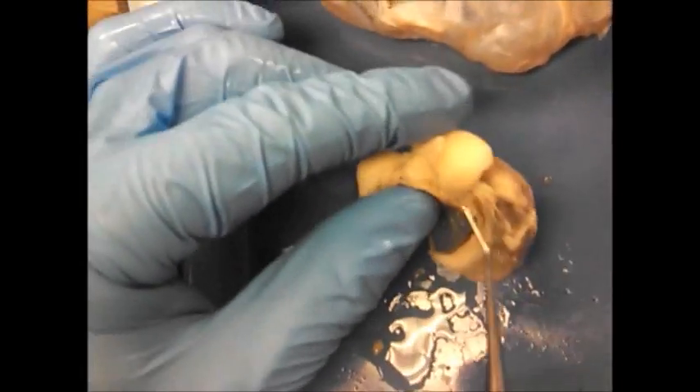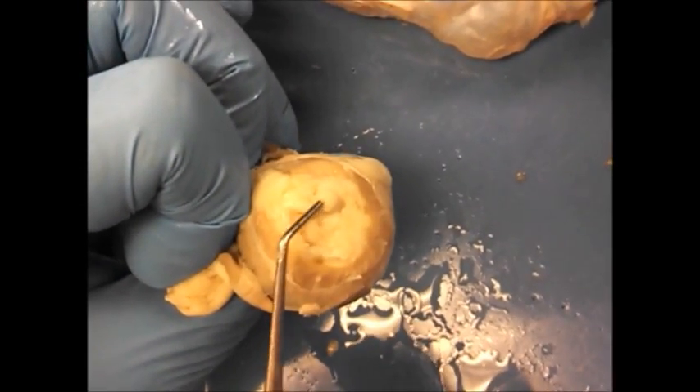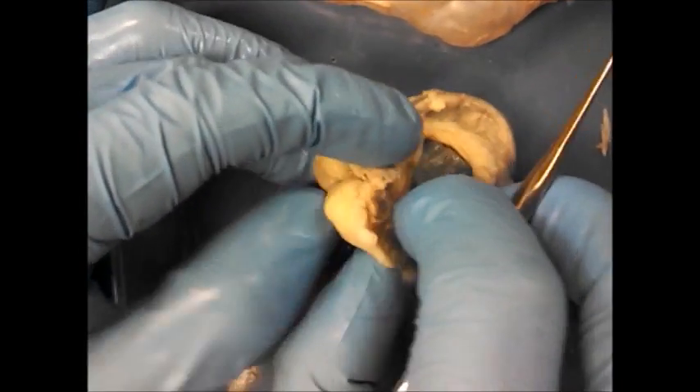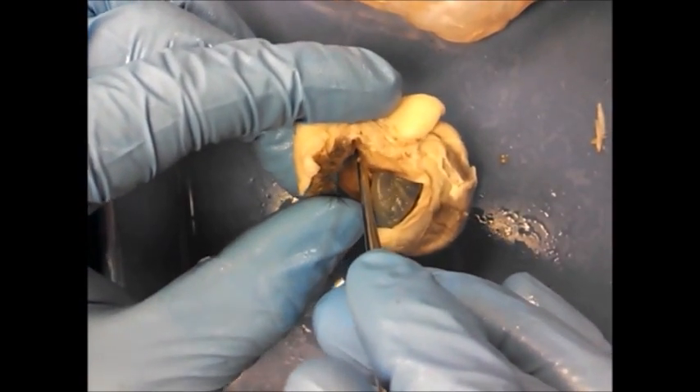All of the outside is the sclera — all this white looking area. You can usually find on the back the optic nerve. In the front, the cloudy looking part — it's normally not cloudy — that's the cornea. There's a little eyelid on here, so if you put a pin under that eyelid, we're looking at the conjunctiva.